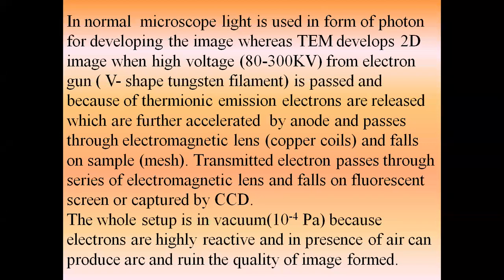In TEM a 2D image will be developed, whereas in SEM a 3D image will be developed. Both types of electron microscope develop black and white images.